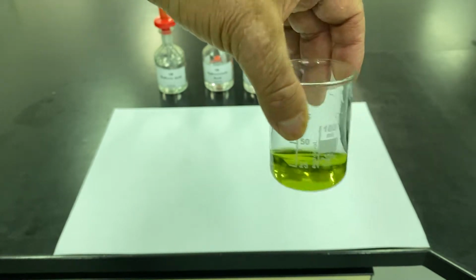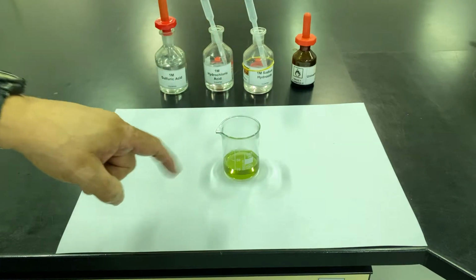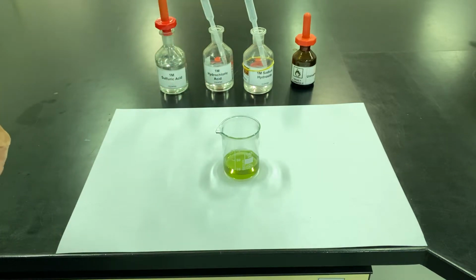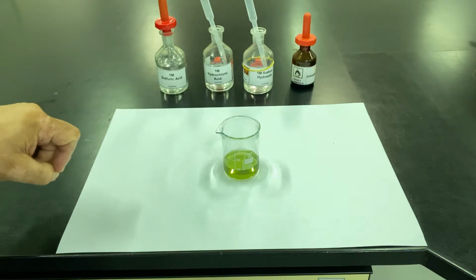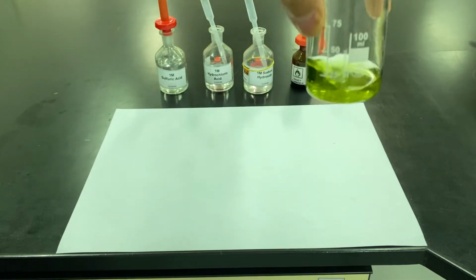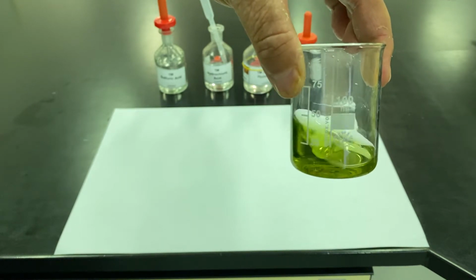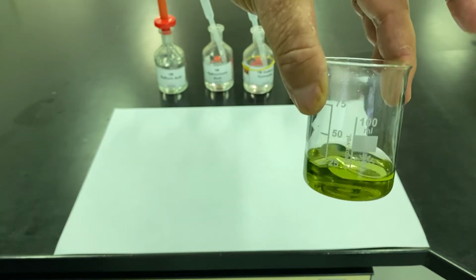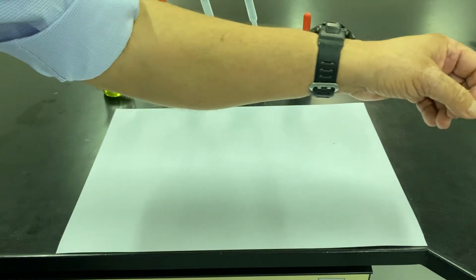Okay, but what is in that solution? So all of the hydrochloric acid and all of the sodium hydroxide has reacted together. Now, if you remember from last lesson, the products of these two neutralizing are sodium chloride plus water. So this should be just sodium chloride dissolved in water. Now, if I was to evaporate the water off, that would leave me with salt. Okay, the same table salt that we put in our food. The only issue is it would be green because we've got the universal indicator as well. Okay, right, let's look at another reaction.